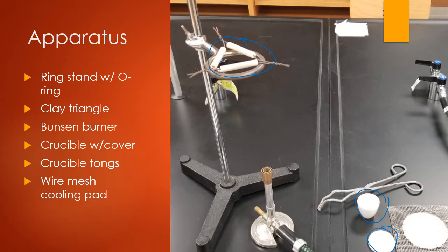We also need crucible tongs. This is a special tong to pick up the crucible because we are going to be superheating it, and it's going to get very hot, so we definitely don't want to touch it with our fingers. We'll use that tong to take it off of the clay triangle and set it on this wire mesh cooling pad. We also need a Bunsen burner to do the heating.